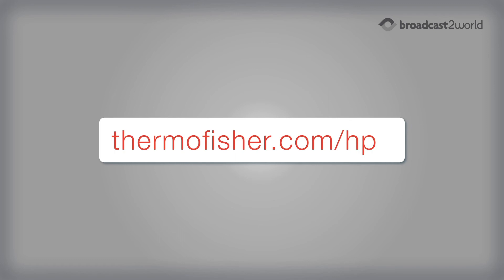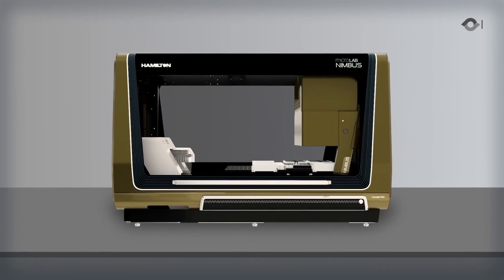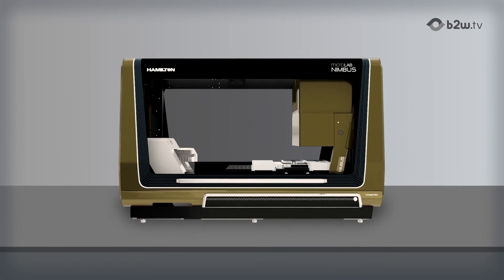You can get online even quicker with help from our HID professional services. Gain confidence and streamline your workflow with the ID Nimbus Presto System.